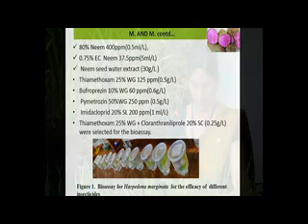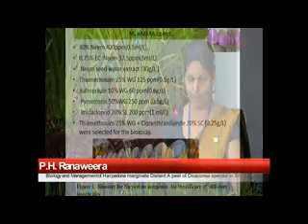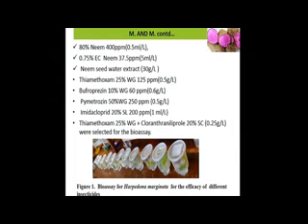Neem formulation, neem seed water extract, and some synthetic insecticides were used in the bioassay. This figure shows how we arranged the bioassay under laboratory conditions. To keep the leaves fresh, we introduced a smaller cup filled with water, and net materials facilitate air circulation.